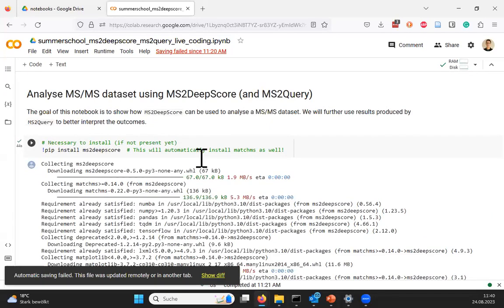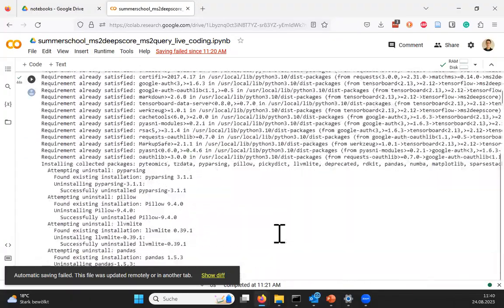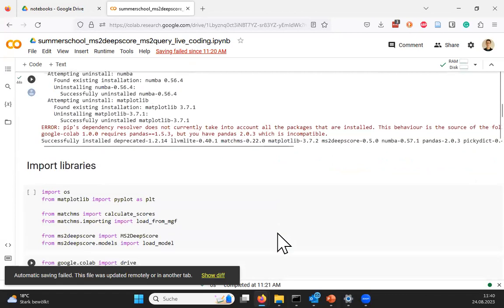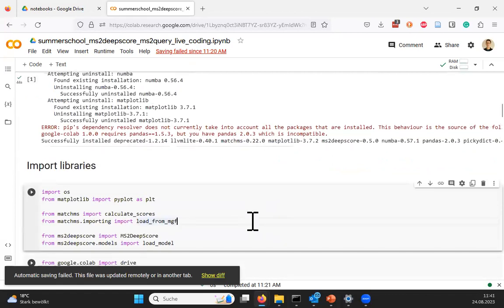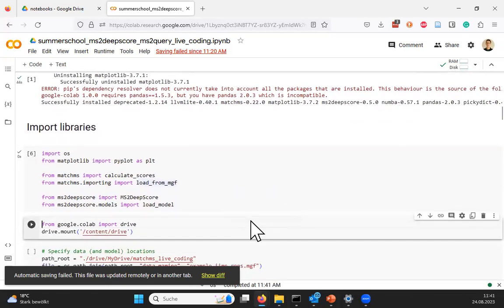It still should run in a minute or two, but it's installing these deep learning frameworks, and they are fairly big libraries. So that's why we do this in this notebook version, also because they are known to cause trouble on your local computers, but you should be able to get it to work eventually. If you install this, this code should execute fine. And we will go quickly through these code cells because they are exactly what we did before in the other methods. They should be exactly the same.